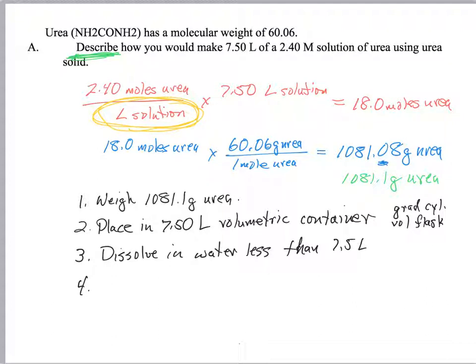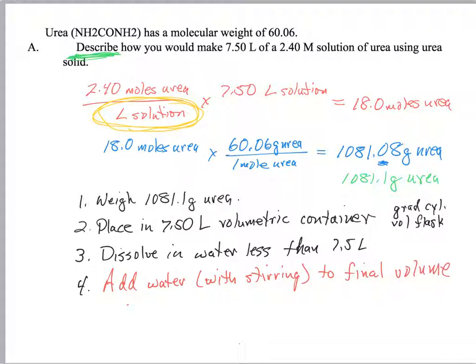So the very last thing you do is add water, some people want you to say with stirring, because mixing does affect the volume, to the final volume, which is in this case 7.50 liters.